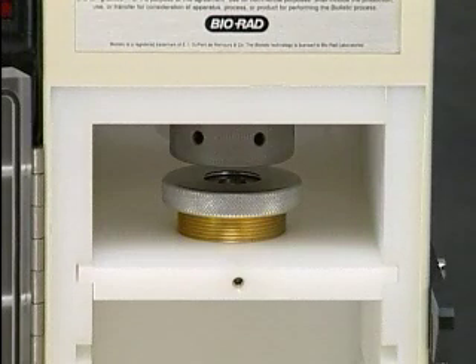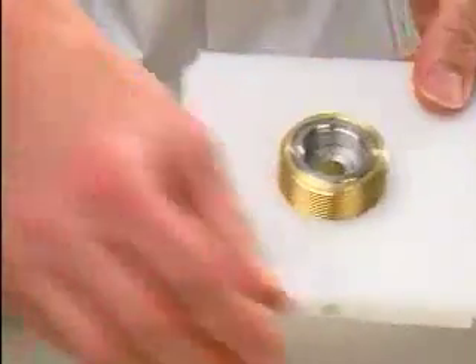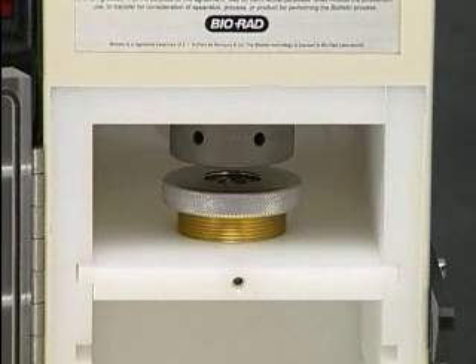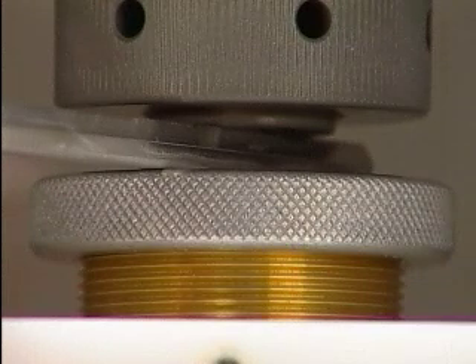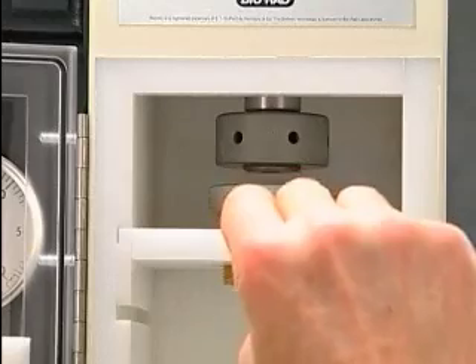Set the distance between the rupture disc retaining cap and the microcarrier launch assembly by releasing the set screw. Assemble the microcarrier launch assembly and insert it fully assembled on the highest slot within the chamber, with the set screw on the white plastic shelf facing outward. A quarter-inch distance is recommended for initial experiments. Take the quarter-inch hexagonal adjustment tool, place it into the gap, and turn the adjustable nest until the macrocarrier cover lid touches the gap tool. Fix this setting by tightening the set screw.